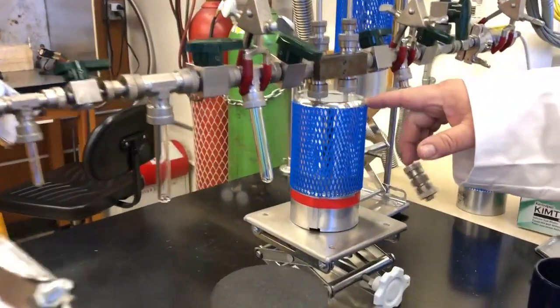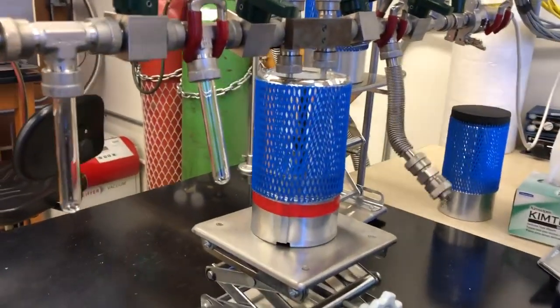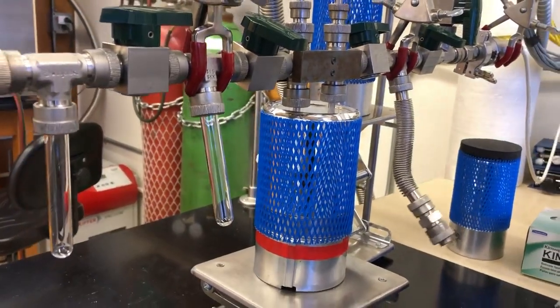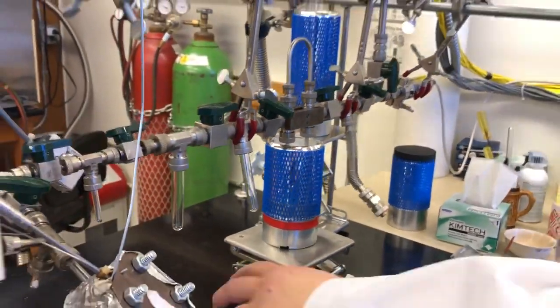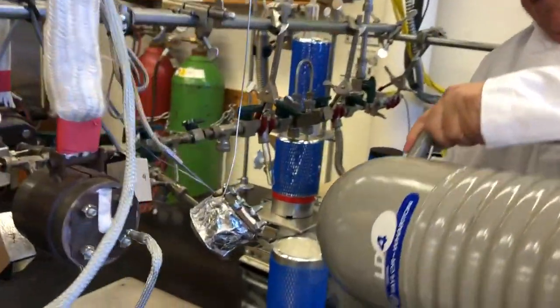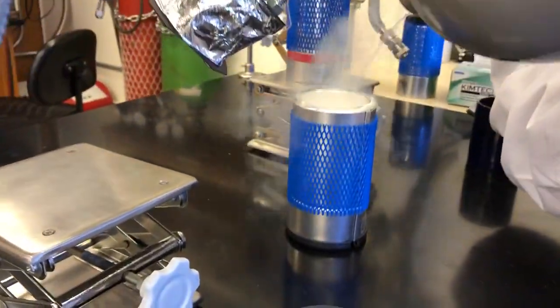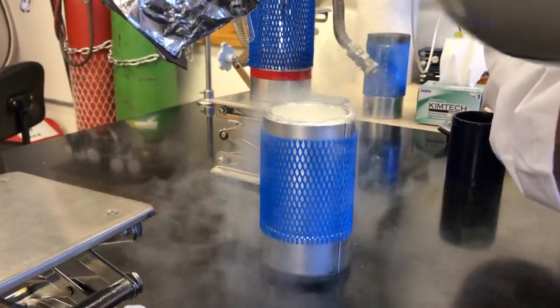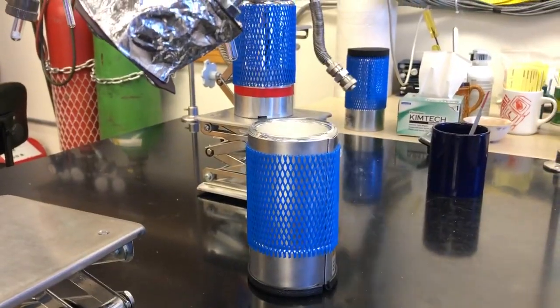Now what this cold trap is going to do is freeze out the water vapor that formed during the combustion of the sample. But it is not cold enough to freeze CO2, excuse me. So I need to use liquid nitrogen to do that.